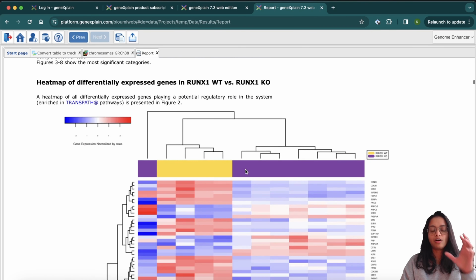It performed the network analysis and identified the most promising molecular targets, as well as these targets could further be of importance for further research or drug development. And it also identified, based on these targets, the most promising treatment candidates, which could be further tested. So this was just the overall gist of the insights and the findings that it generated through this pipeline.